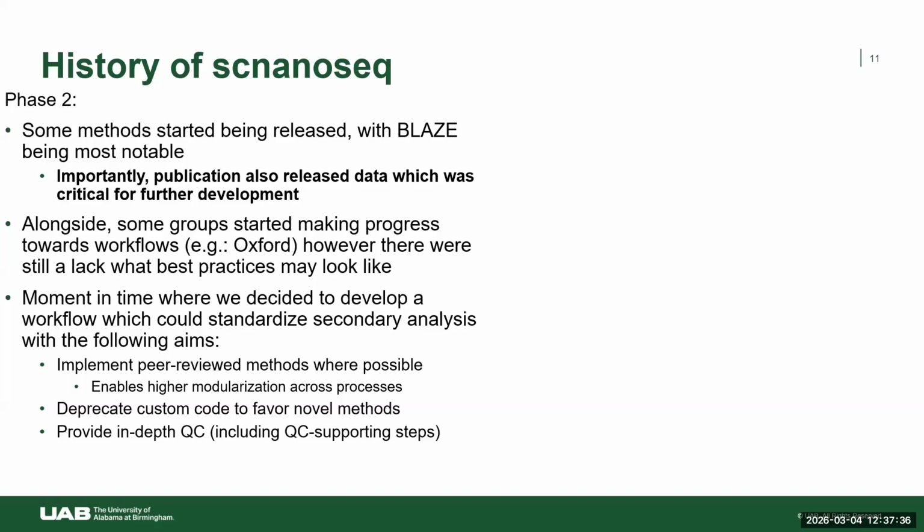We still, to this day, have some custom coding where needed, like things like tagging barcodes and barcode extraction. But our hope was to use the nf-core RNA-seq model, if you will, where we're really just using and implementing as much as possible methods that have been peer reviewed and that will be maintained in the long run. So we started to put these methods in place in this particular workflow, and ideally favor that in the long term.